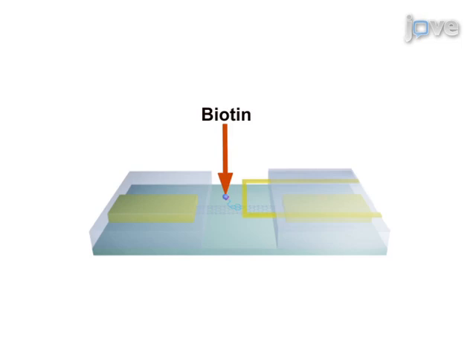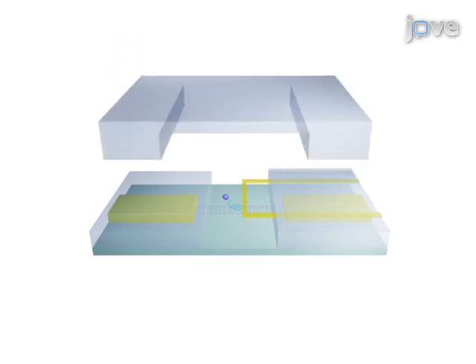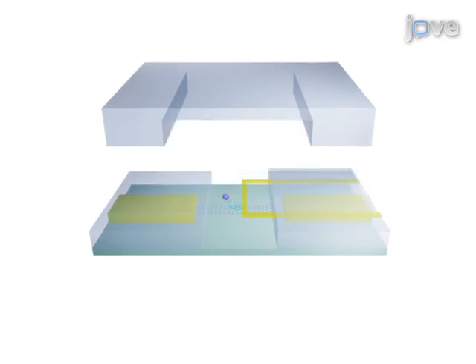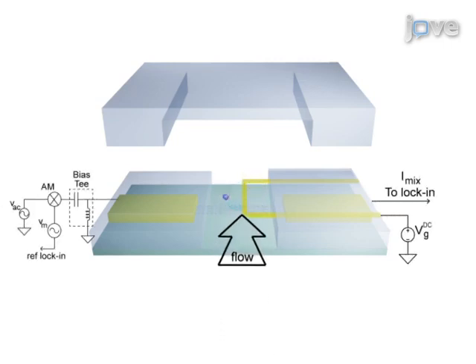First, the nanotube transistors are fabricated and functionalized with receptor molecules. As a second step, the devices are encapsulated with a microfluidic flow channel, which allows biomolecule sample solutions to be injected for real-time sensing. Next, the single-walled carbon nanotube field effect transistors are operated as high-frequency mixers in order to overcome an ionic screening effect. At high driving frequency, ions in solutions can no longer screen the nanotube sensor effectively, allowing the oscillating dipole moments of surface-bound biomolecules to be detected.